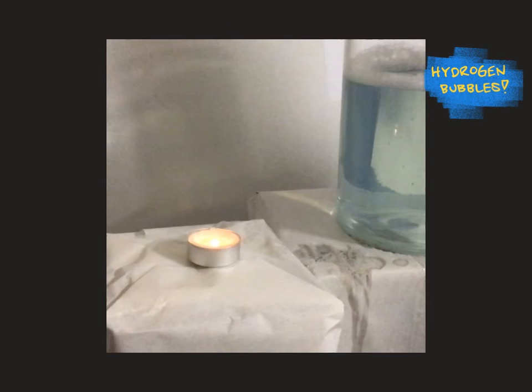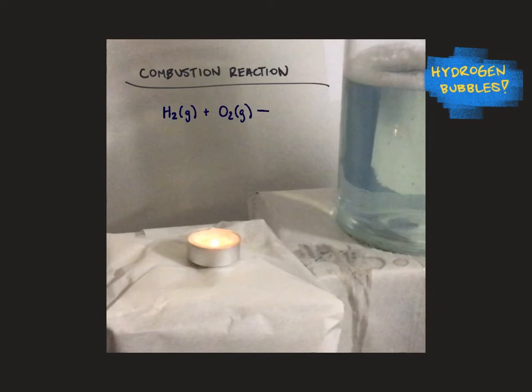and you see a nice little tiny explosion. Now, the reaction that's taking place there is what we refer to as a combustion reaction. A combustion reaction is a reaction which occurs when something is burned in the presence of elemental oxygen. There's oxygen in our atmosphere, and the fuel that we're burning here is hydrogen fuel. Some of you might have heard of hydrogen's use as a fuel in what we refer to as a fuel cell vehicle. The hydrogen gas, when it burns in elemental oxygen, is a cool chemical reaction because the product of this combustion reaction is a very, very familiar one. The only thing produced from the combustion of hydrogen gas is water.